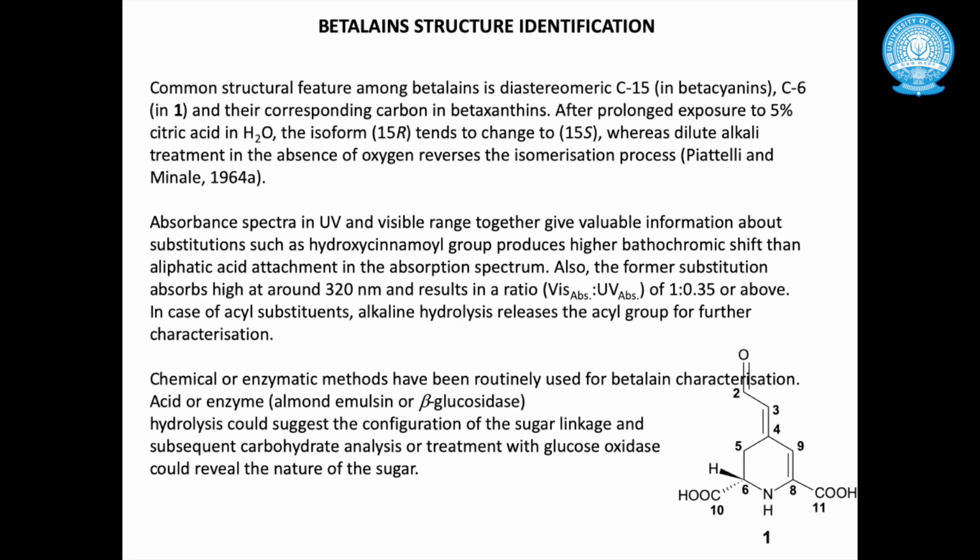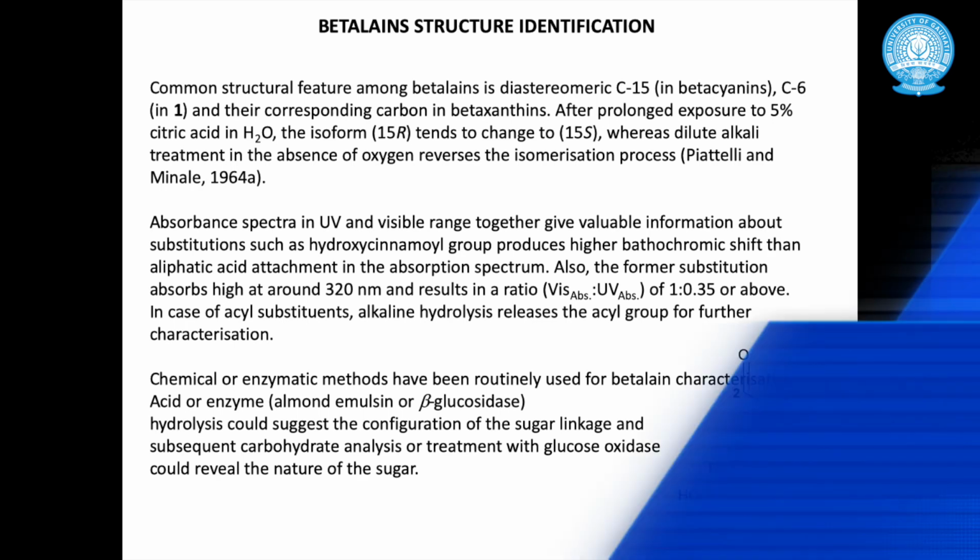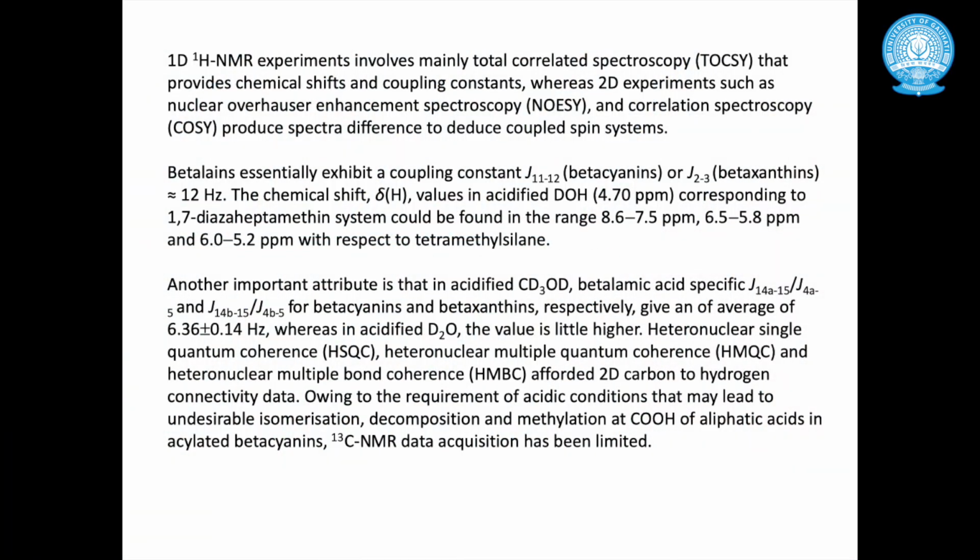Even then, if we are not able to confirm the structure, we go for X-ray crystallography. Through X-ray crystallography data, we will be able to confirm everything down to the level of a covalent bond, that is around 2 angstrom or slightly less than 2 angstrom bond distance.